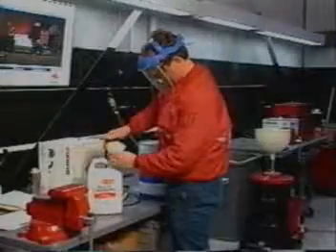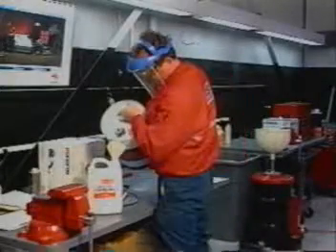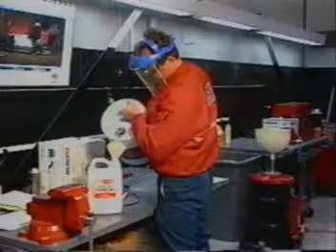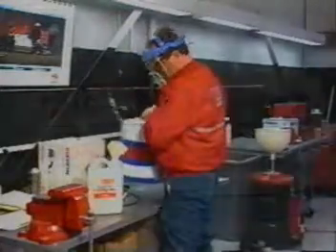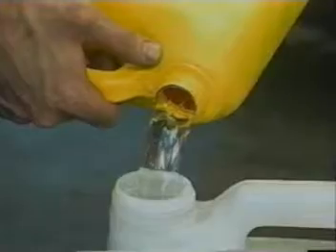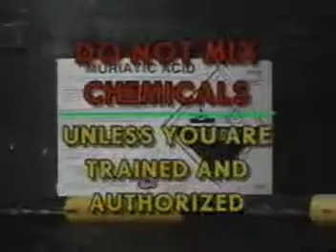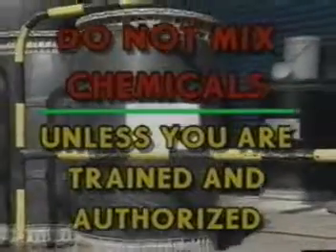One thing that should be taught and fully understood by employees is that mixing chemicals without proper training and authorization is very hazardous. If you get the wrong mix of chemicals, you could be changing the physical or health characteristics. You could take two chemicals that, when used individually, are relatively safe. However, when you mix the two together, you could form a very dangerous or hazardous mixture. Don't mix chemicals unless you've been trained and authorized by your employer.